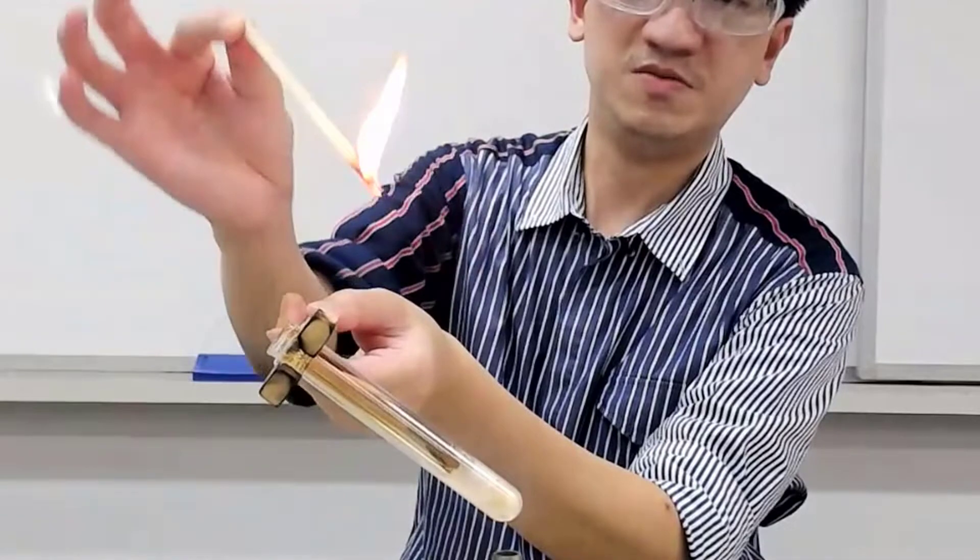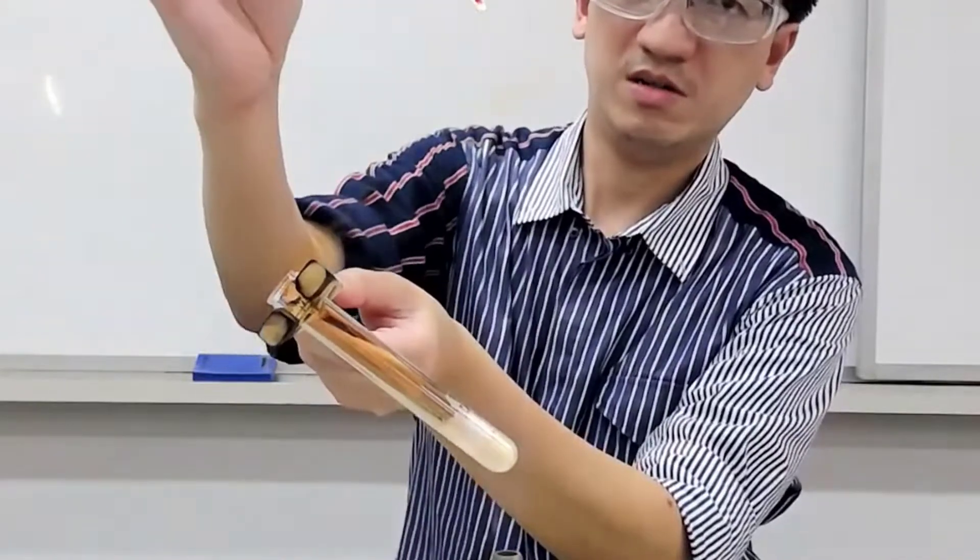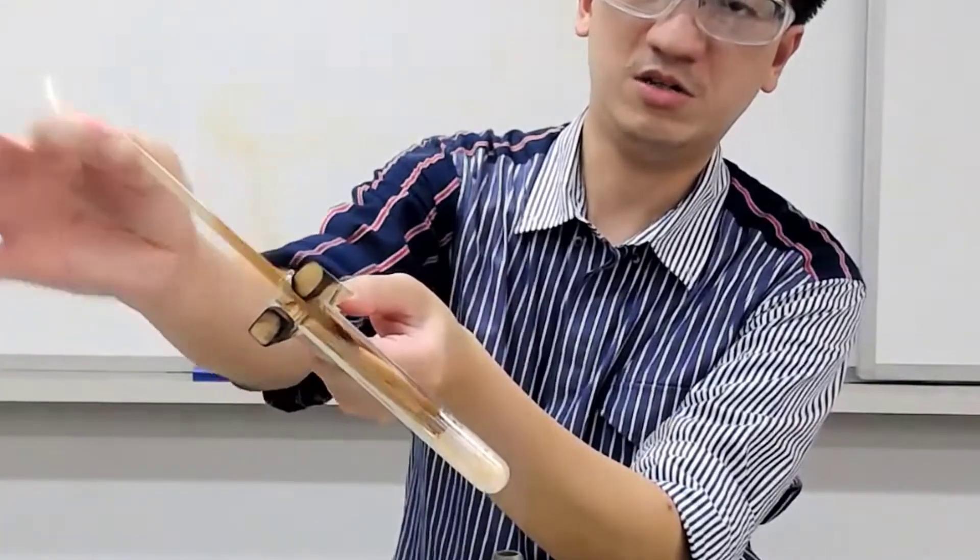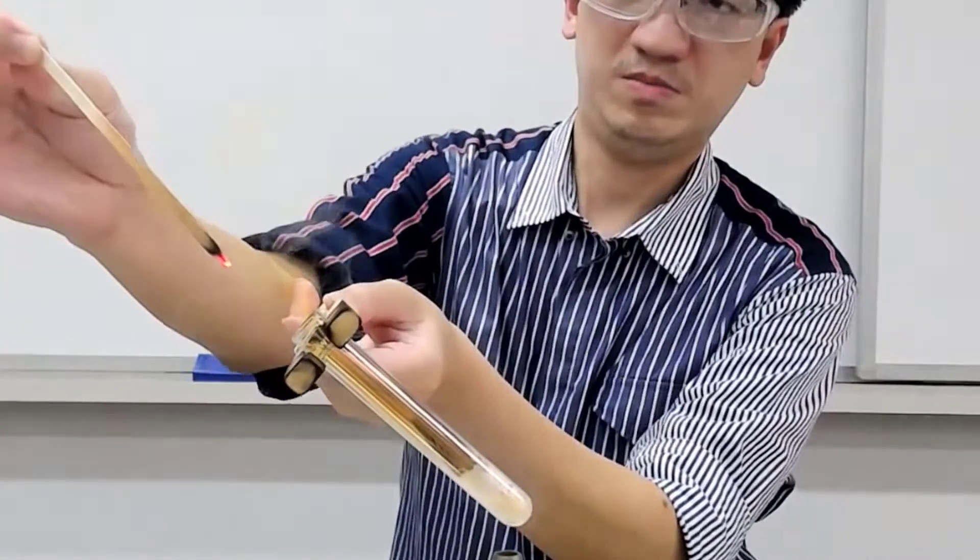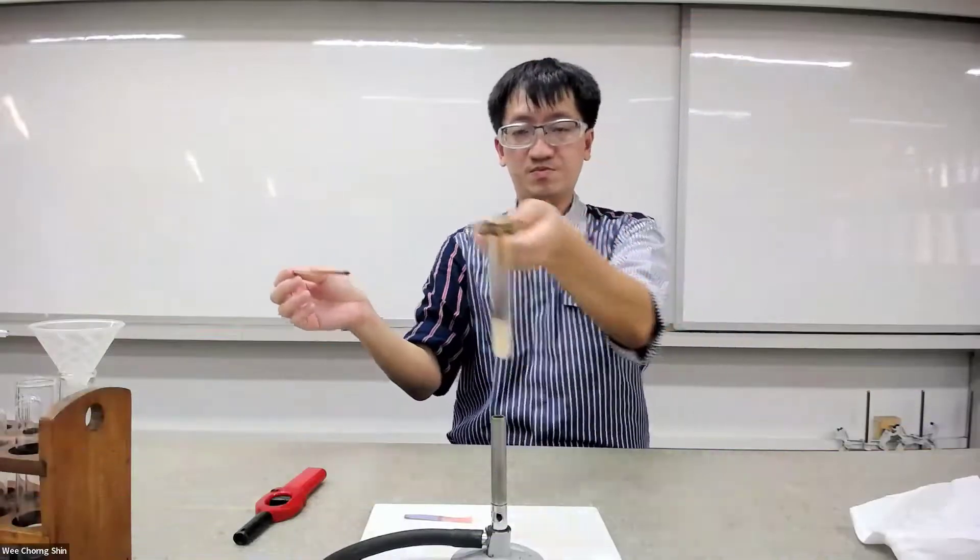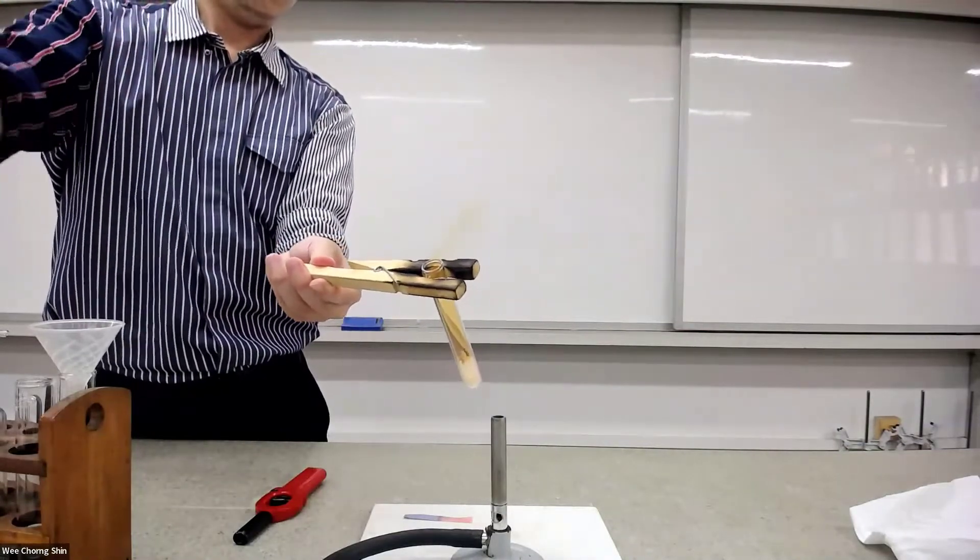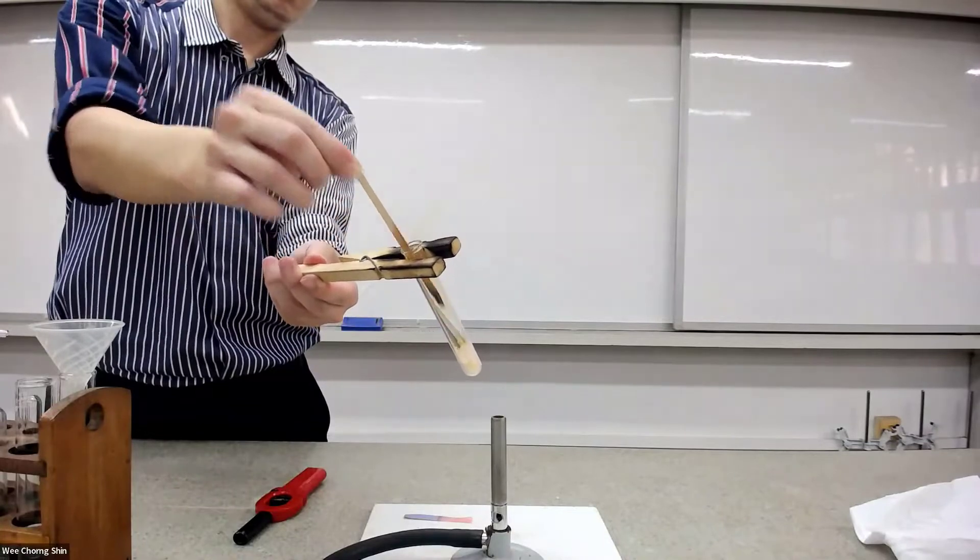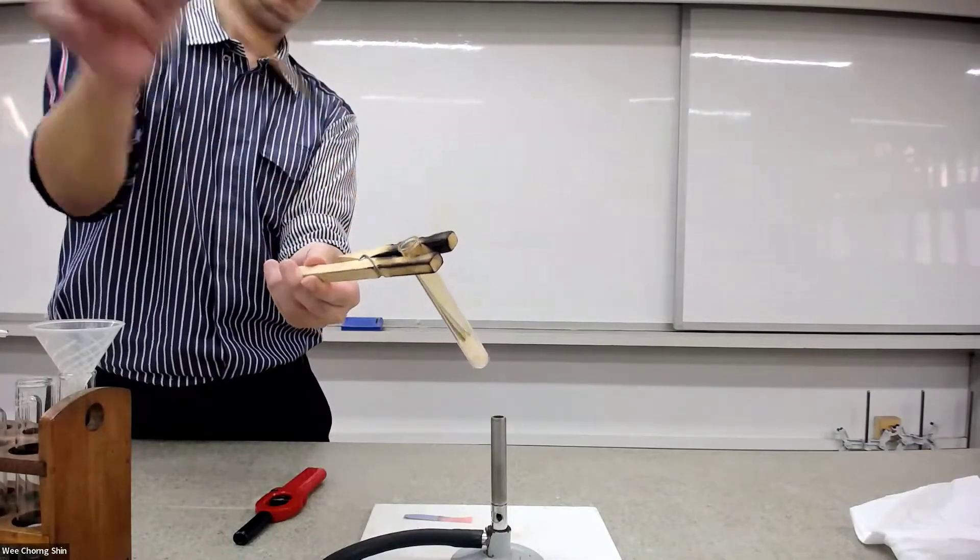We'll see whether it can be observed. I think it glows a bit more. Let's try again. I think it glows briefly. Maybe we'll try once more. I think it glows a bit more. Very brief.